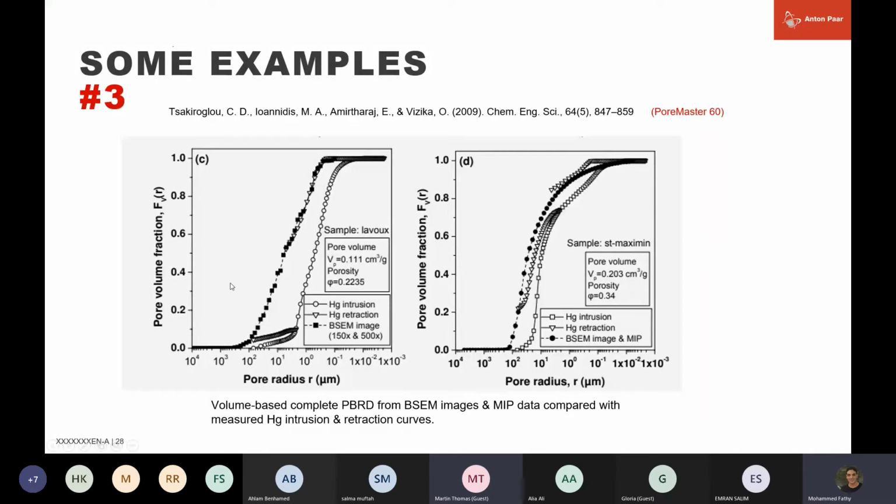But also what has been done here is partial intrusion extrusion. So not completely intruding all of the pore structure and extruding from it, but, as more clearly seen on the right hand side, you can intrude all the way up and extrude. Okay, intrusion, extrusion, or here they call it retraction.